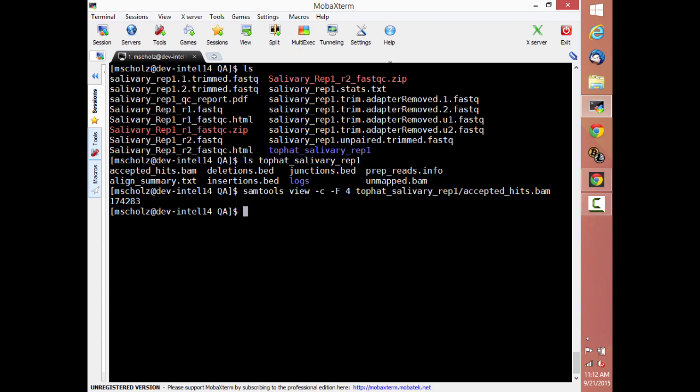and that happens to be a highly expressed gene in your condition, you won't be able to tell the difference, right? So when you start dropping down below 90%, something could be wrong, or it could just be that your reference is bad, or it could be that you've discovered a new gene that hasn't been finished yet. All of these are options, but as a rule of thumb, anyway, 90% is a good cutoff to think that you have good sequence data for a model organism.